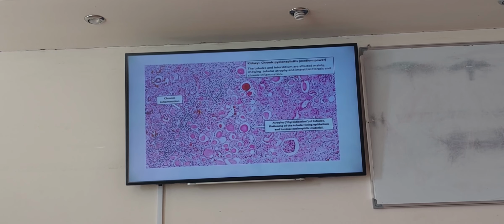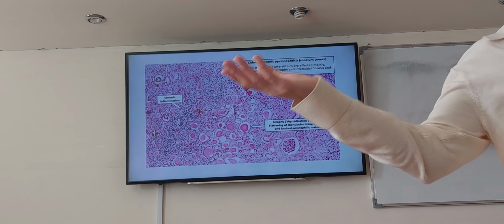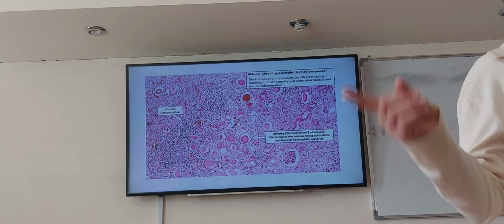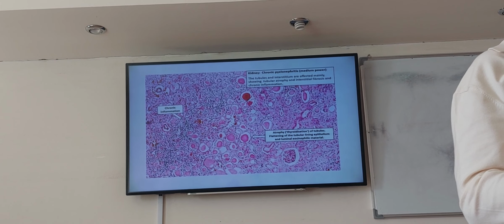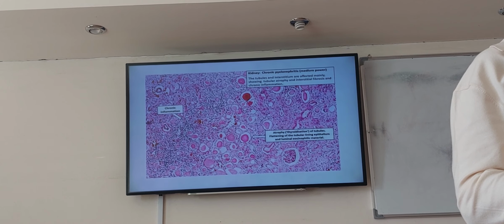Histologically, the architecture. Number one, it can be interstitial, in between, diffuse; you can tell me diffuse or interstitial. Number two, it forms polyps. Number three, granulomas, epithelioid and foreign body granulomas.